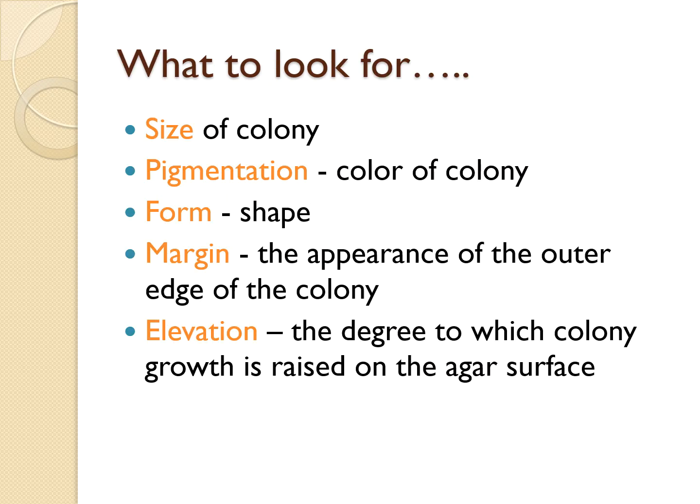You're looking for the size of the colony. You're looking for any color or pigmentation of the colony. You're looking for form, which is the shape of the colony. You're looking at the margin, which is the edge of the colony. What does it look like? And the elevation, and that is how far has it grown up off of the agar surface.